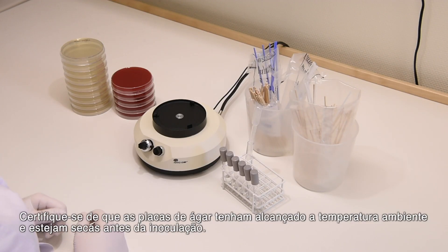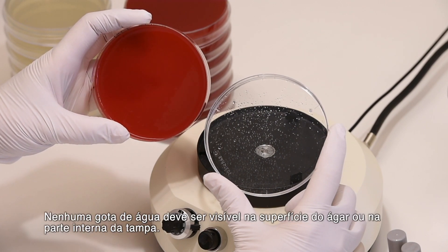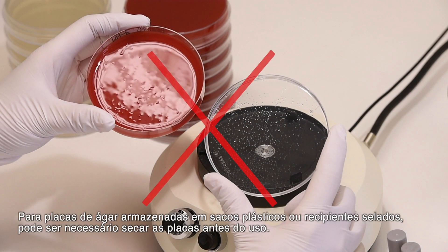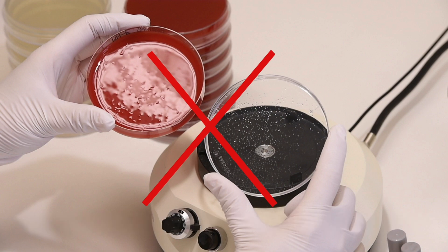Make sure that agar plates have reached room temperature and are dry prior to inoculation. No drops of water should be visible on the surface of the agar or inside the lid. For agar plates stored in plastic bags or sealed containers, it may be necessary to dry the plates prior to use. This is to avoid excess moisture which may lead to reading difficulties due to fuzzy zone edges or haze within zones.